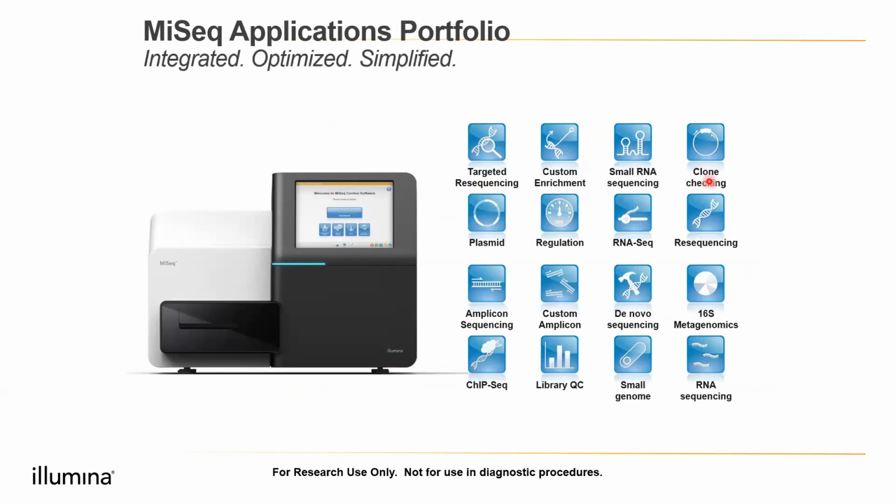So these are the applications. Again, mostly the specs are similar to MiniSeq, so small genomes can be done. And apart from this, one major highlight is de novo sequencing, wherein you will require a larger read length. So that can be done. Also library QC, which I discussed. If you want to QC check the libraries and check their performance, this can be done on the smaller machines prior to going to the bigger machines.